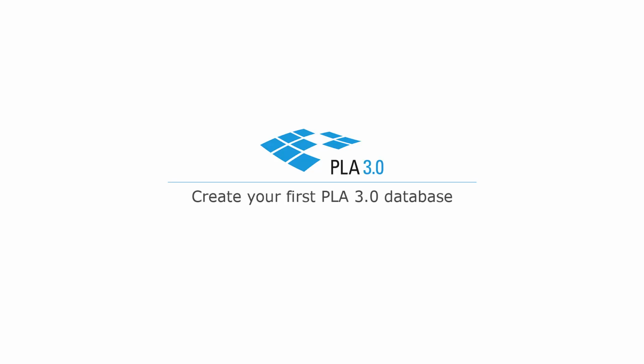In this video, we will discuss the setup of a database for testing and evaluating PLA.